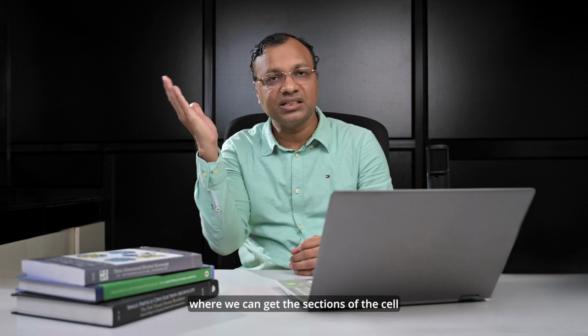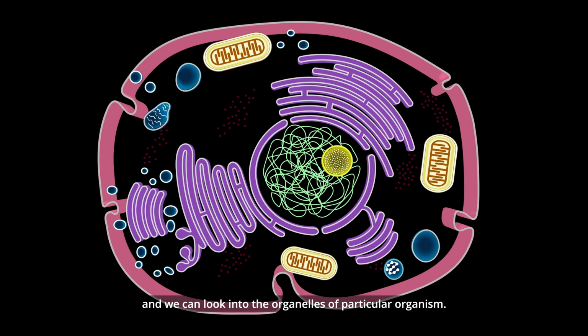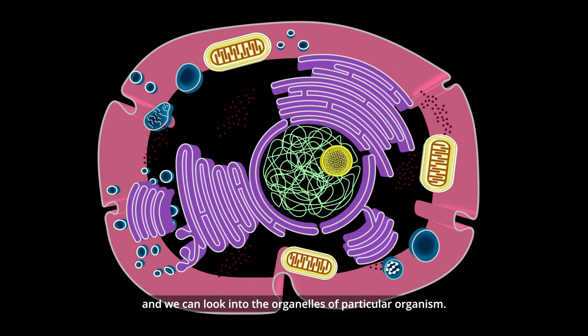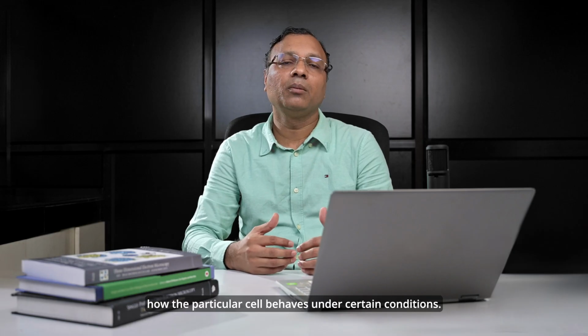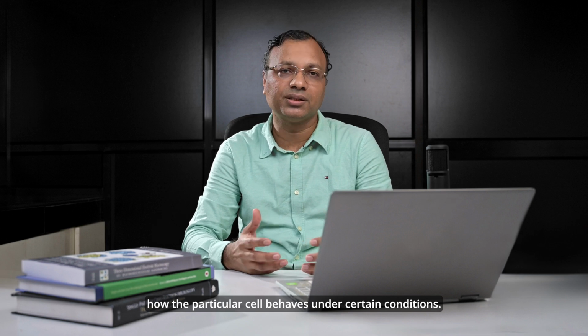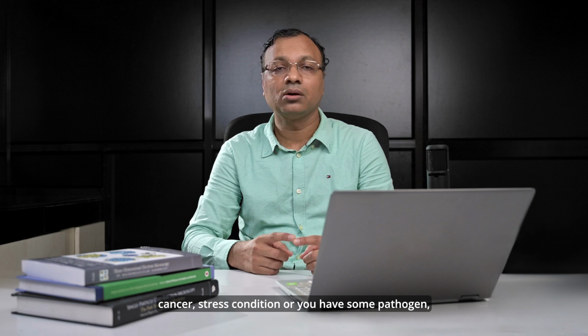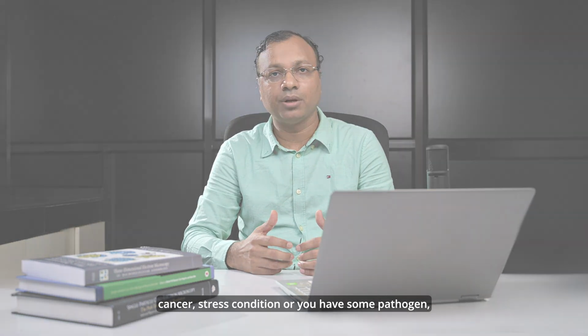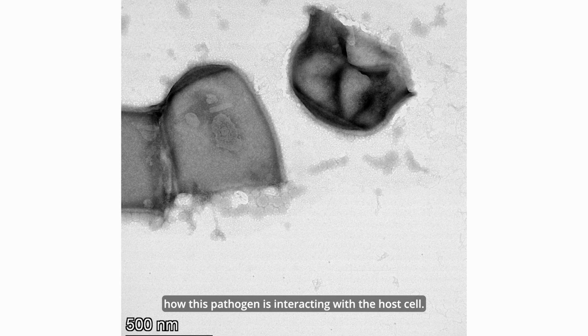When it comes to the cellular level, we can have the cryo-electron tomography technique, where we can get the sections of the cell and we can look into the organelles of a particular organism. Many times we want to understand how the particular cell behaves under certain conditions. Let's say it could be in terms of cancer, stress condition, or you have some pathogen, how this pathogen is interacting with the host cell.